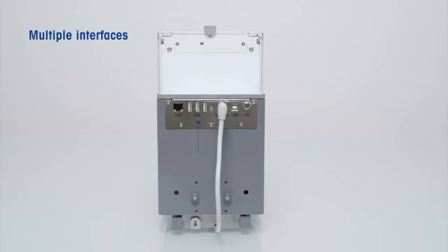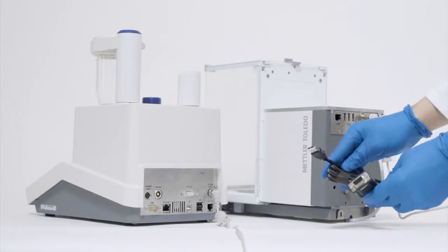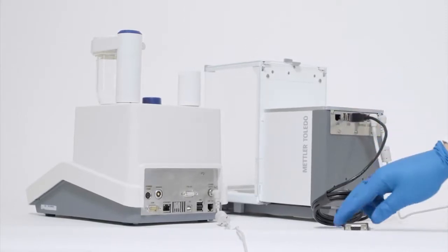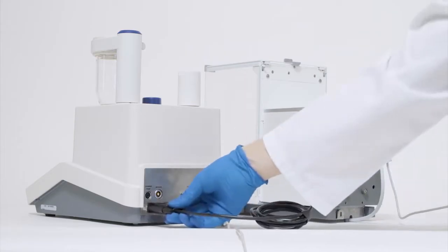Three USB ports provide serial connections to peripheral devices such as printers or barcode readers plug and play or to a PC to collect data. RS-232 connections are also possible by picking the right cable without the need of installing any drivers. Just plug and play.